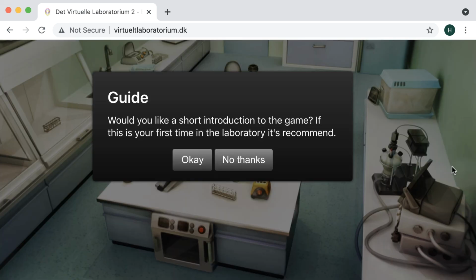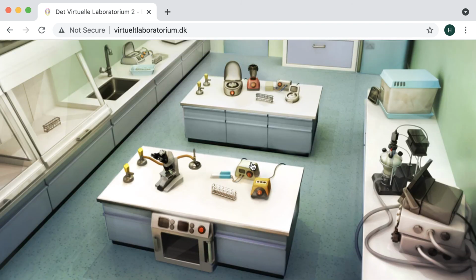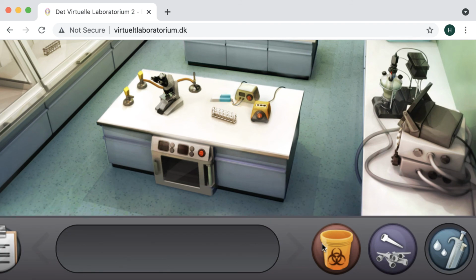First time into the lab, it is definitely worth exploring what is in the lab. For today, though, we will select no thanks for the laboratory tour. The phenomenon behind the Insulin Sciventure is that student scientists will enter this virtual biotechnology lab where they will be challenged to use their skills with transcription and translation to have yeast create human insulin. To successfully complete the challenge, they will essentially replicate the pioneering work behind Eli Lilly's introduction of Humulin, which was FDA approved October 1982.